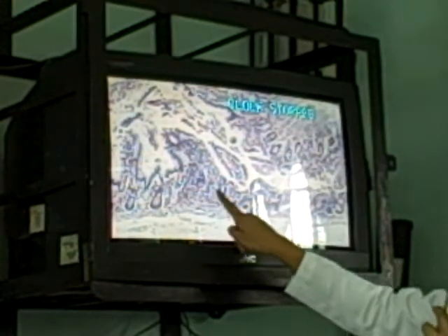During my time, not so long ago, we had several slides that contained numerous Peyer's patches. Probably they all died early. That's why we don't have any slides anymore. I don't know, but this is more of dense lymphatic tissue, more lymphocytes, but they do not form nodules. Okay?